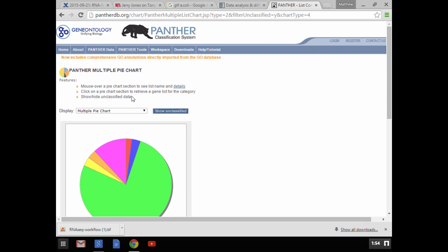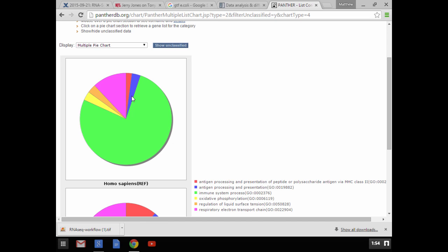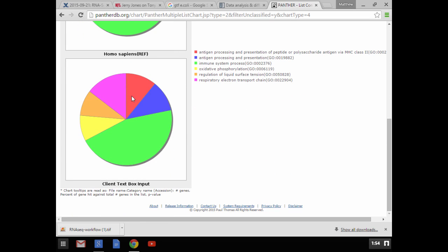And you can make all sorts of pretty pictures. Which, again, is not a terrible thing, right? Pictures are great. The only statement I will make after that is that I am highly in favor of finding ways to get a website or a tool to make charts for you, because you need charts for publications, because it is way easier to describe information in a chart than it is in almost any other format.